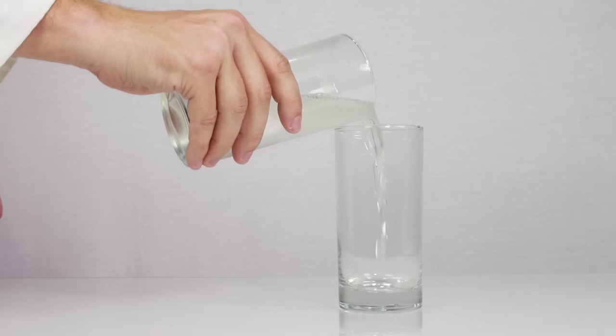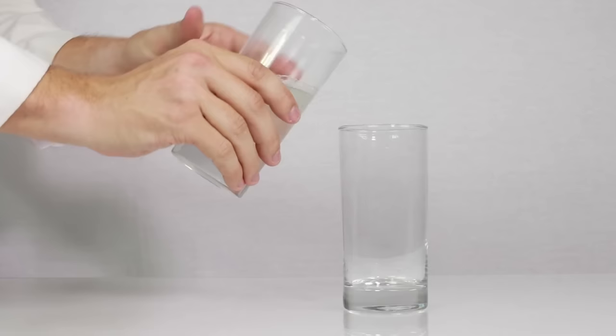Triiodide reacts with starch to create a darkly colored compound. However, this reaction is only allowed to take place once another chemical reaction has run its course.